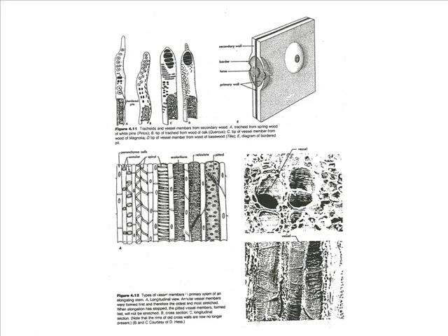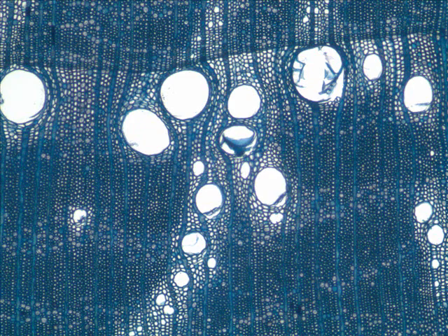That's right. There is one other possibility, and those are fibers. I don't have a nice picture of fibers, but they're usually smallest in diameter, very thick-walled, very tough cells. They are hollow in the middle, but that hollow does not connect to the outside world, so fibers provide strength. In fact, that's what makes hardwood, is it not? The presence of many fibers.